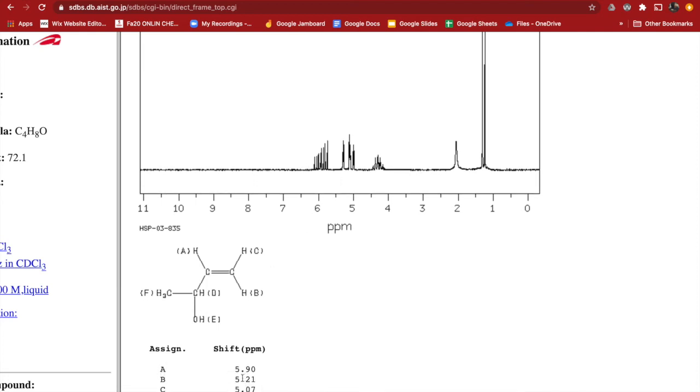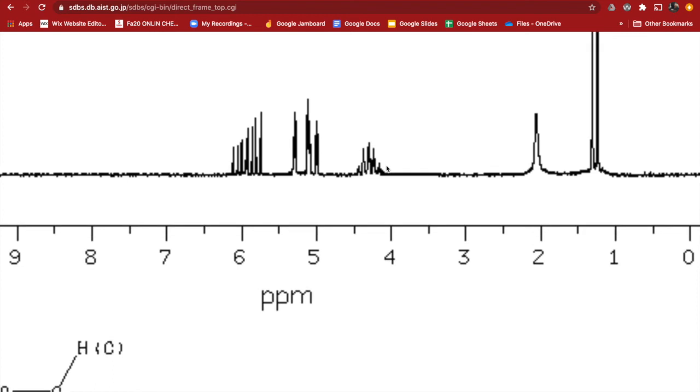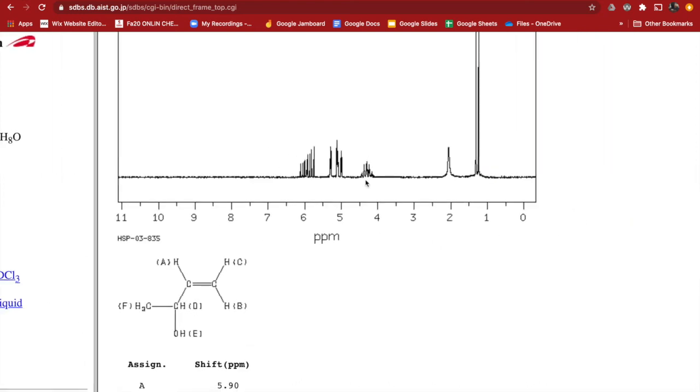And they are calling him D, this guy. And so, yeah, I don't know, that looks like a septet. 1, 2, 3, 4, 5. Yeah, I think it's a mess. If we had the ability to zoom in and see this better, we'd see it's probably not really a nice septet. So that one's, yep.